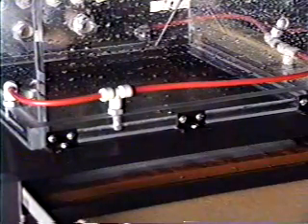The couching arm moves into the forming tank and lifts the sheet off the wire. The sheet is then transferred to the press felt.